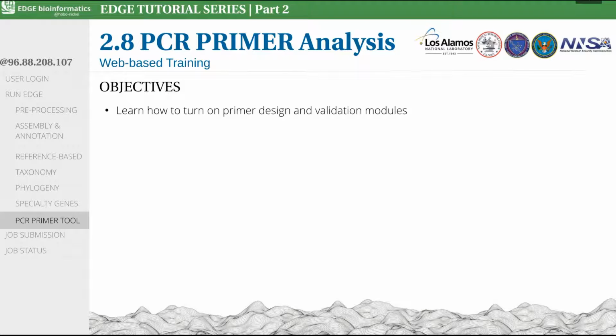Hi, and welcome back to the EDGE tutorial series. This video is going to go over the PCR Primer Analysis module in EDGE. After this tutorial, users will be able to validate existing primers or design new primers based on a sample's assembly.